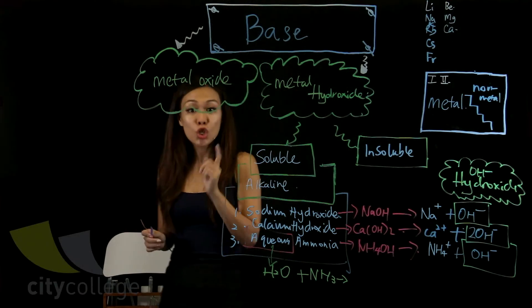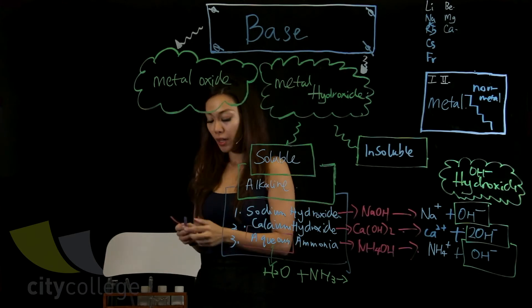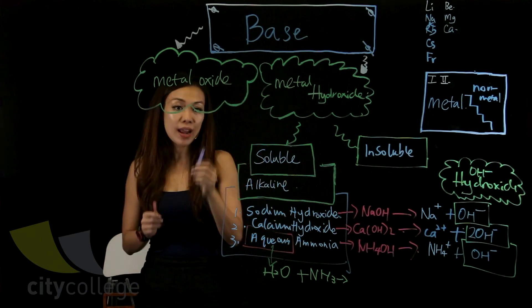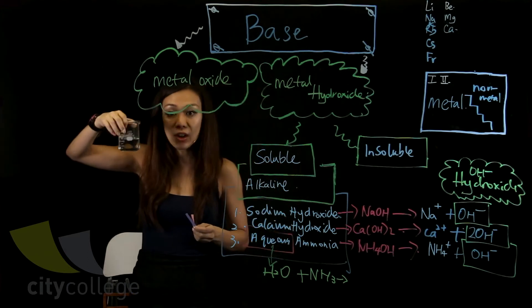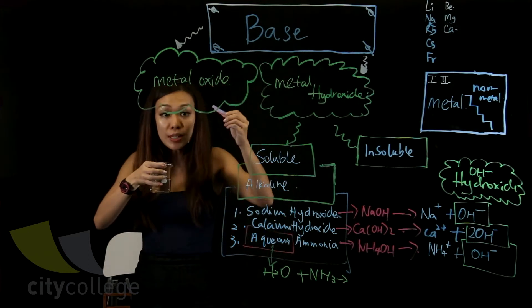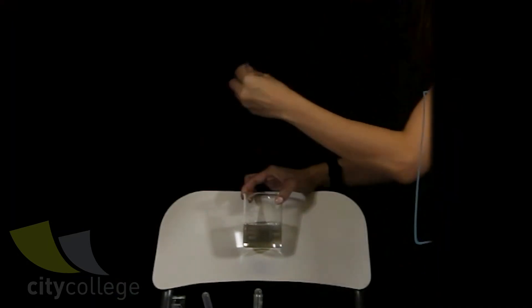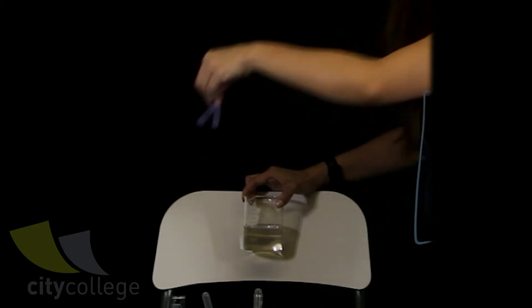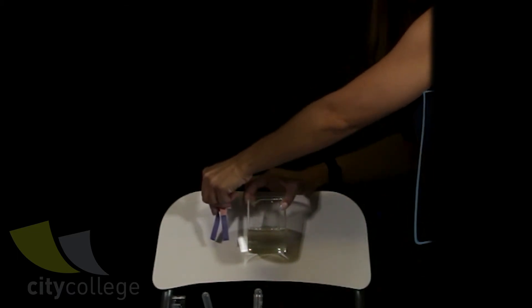Now, at this part, I'm going to show you how to test whether something is an alkaline solution. I have red litmus paper and I have blue litmus paper. This beaker actually inside contains sodium hydroxide. I'm going to dip both of them inside. Can you see a drastic difference? The blue one remains as blue, but the pink one immediately changes colour to blue colour.